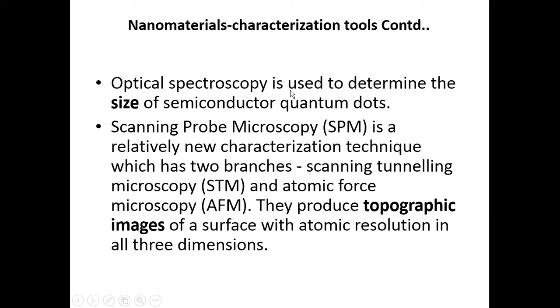That's another characterization tool used in nanomaterials or nanostructures in order to know the quantum dot size of the semiconductor quantum dots. Then another type of characterization tool is scanning probe microscopy.